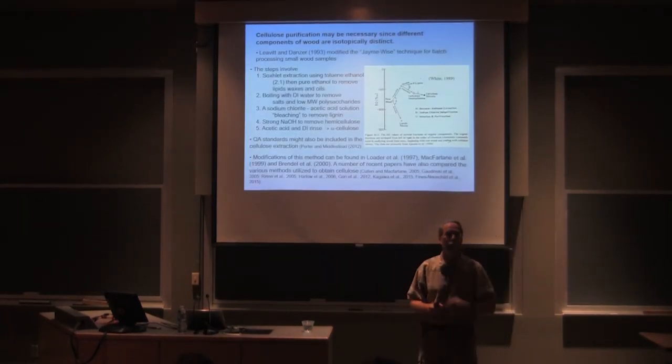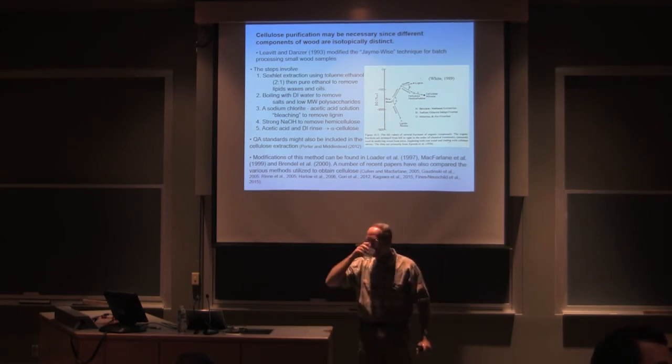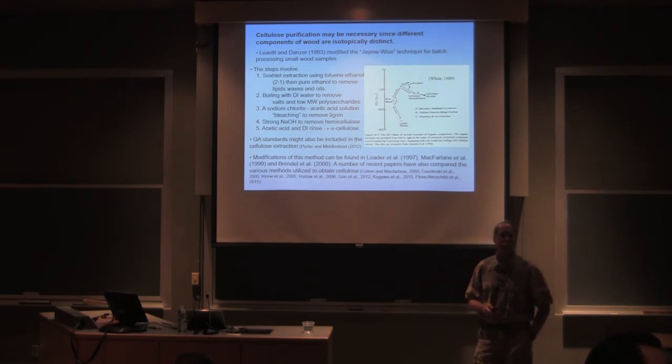Can I just add something to that? For people that work on animals, lipid extraction is a big thing for tissues. This is the same reason you do lipid extraction, because sample to sample, the amount of lipids in your sample might change, and thus your isotope value is going to change too. So it's the same strategy, the same idea behind it.